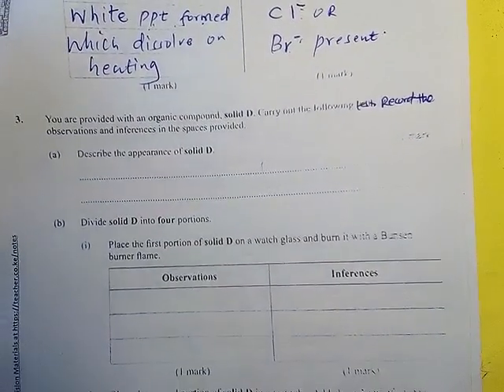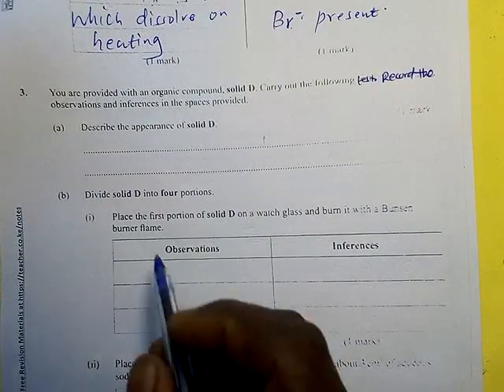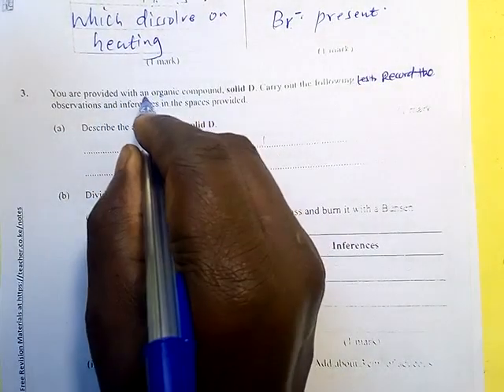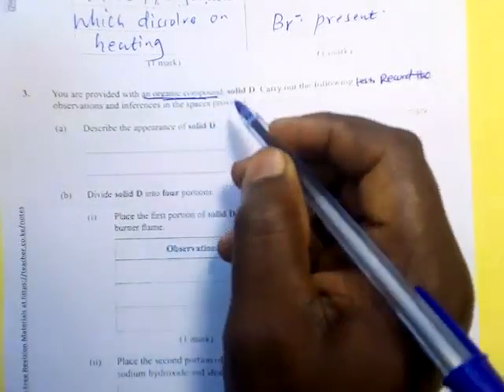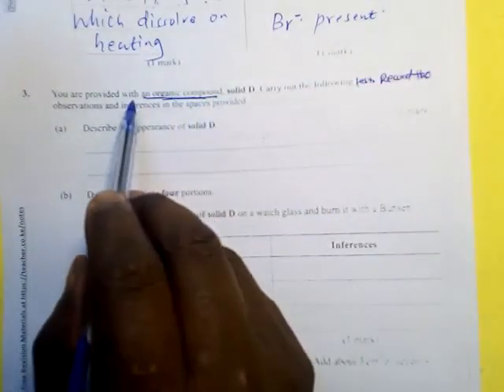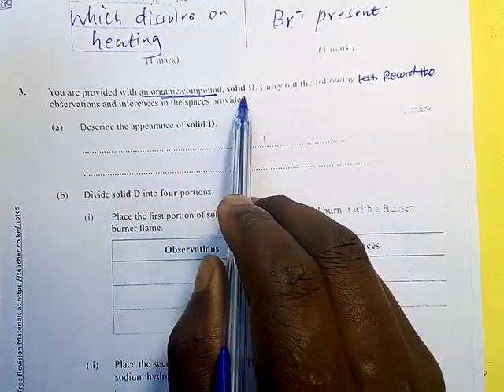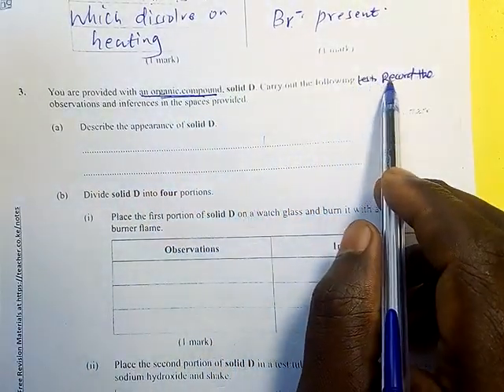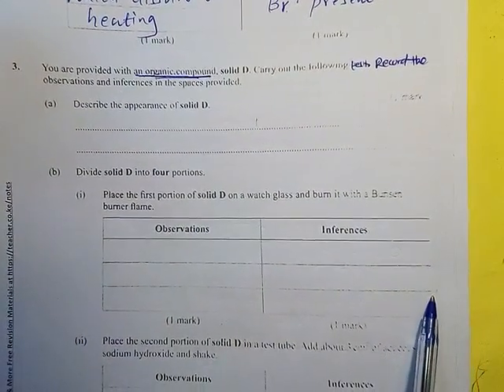Let us go to the last bit of it. You are provided with an organic compound. Very important, you have been told. You are not going to find out whether it is an organic compound. This one you have been given straight that it is an organic compound. Solid D. Carry out the following test, record the observations and inferences in the space provided.